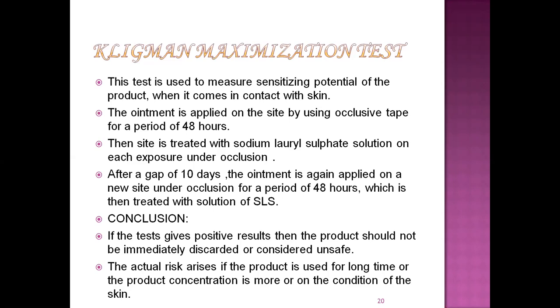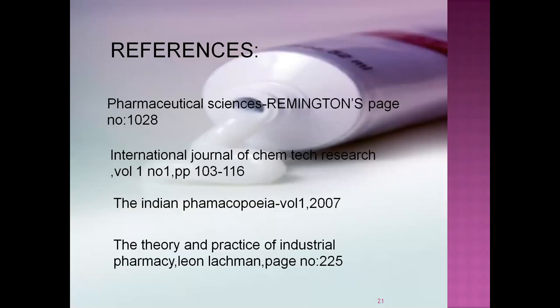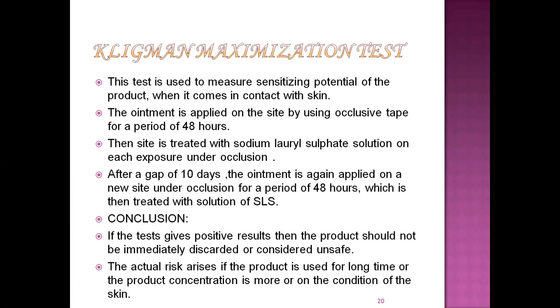In this case, if the test gives positive results, then the product should not be immediately discarded or condemned. Actual risk arises if the product is used for a longer time or at a higher product concentration or under certain conditions. That's how you have to take the conclusion.